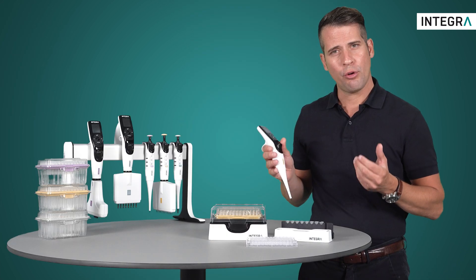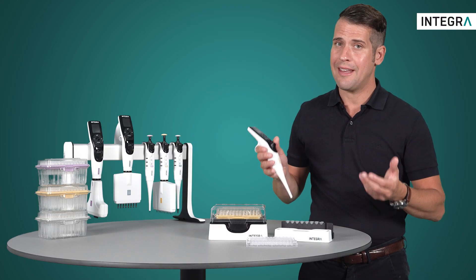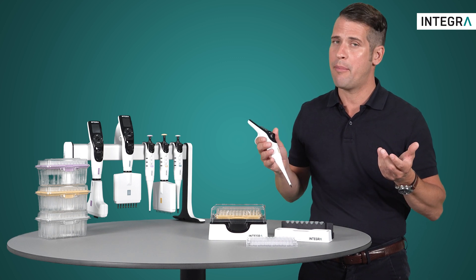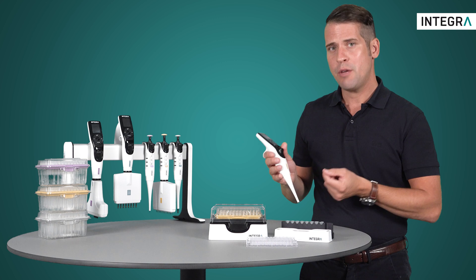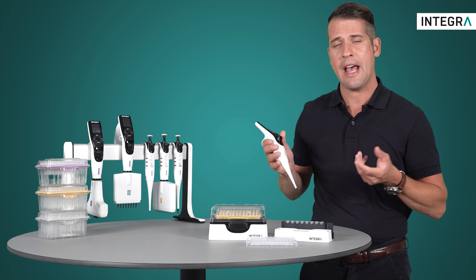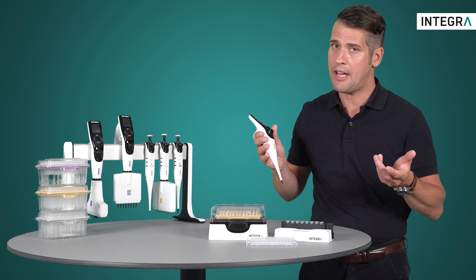Total control of your pipetting together with knowing the exact volume which has been aspirated or dispensed can be a very powerful tool in many pipetting protocols. The manual mode from Integra's electronic pipettes offers a lot of flexibility and functionality. So try it out!